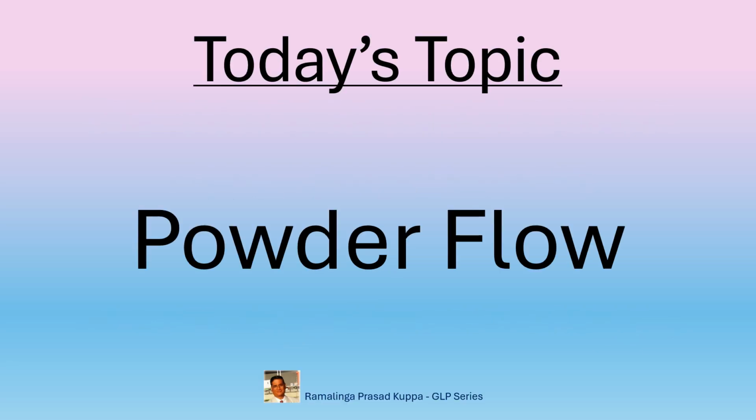Today's topic is powder flow. Powder flow is an important characteristic for any API or granulated semi-finished drug product, to get consistent flow and subsequently consistent quality product without variations beyond specification limits. There are a few aspects of the powder flow characteristics discussed in this video.